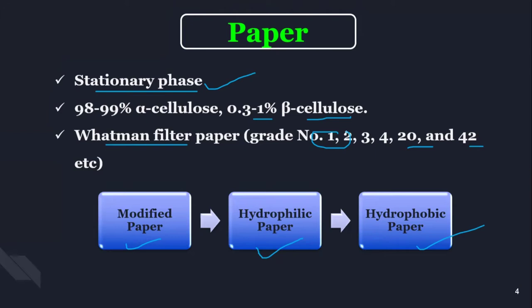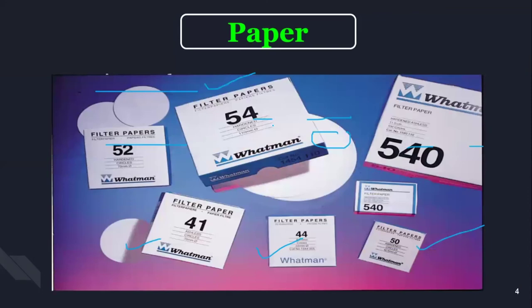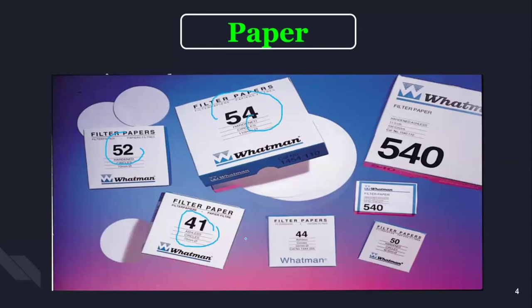Then again, for the paper, you need to select their different running character: it has to be very slow, medium, or fast. In all the kinds they are going to be available. So over here, in aqueous atmosphere, the cellulose fiber of the paper absorbs water and holds it strongly. That's why we choose this kind of paper for the separation. I hope you completely understand now what kind of paper you need to use. So these are some of the grades of Whatman filter paper. You can see very easily the numbers: 52, 54, then 41, 44 like that.